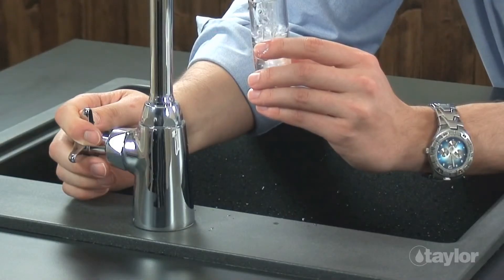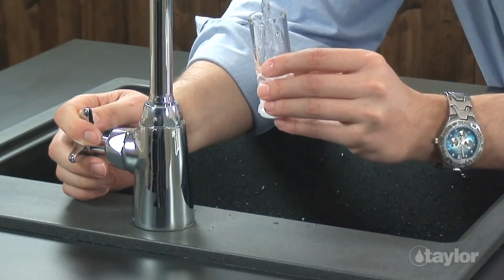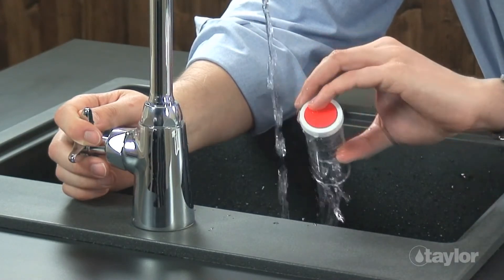When testing is complete, remember to rinse all testing apparatus thoroughly. This will prevent cross-contamination of the next test.